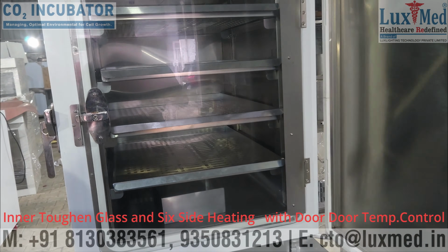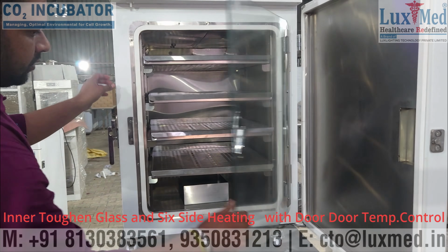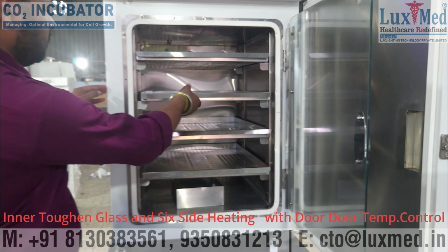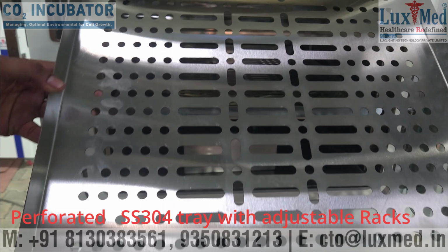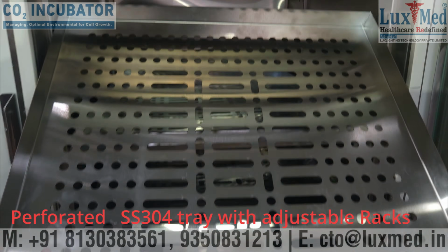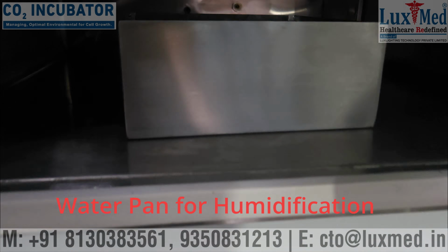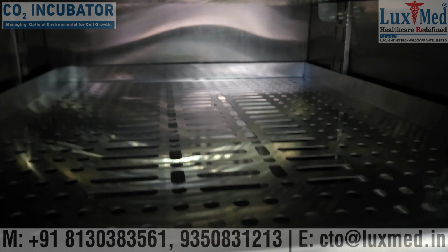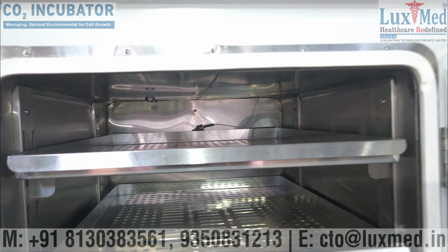CO₂ levels. The CO₂ concentration is carefully regulated, usually around 5%, to maintain the pH of the culture medium. CO₂ interacts with sodium bicarbonate in the culture medium to buffer the pH within the physiological range. Sterility. They are designed to prevent contamination by filtering the air and water used in the incubator, as well as providing a sterile environment for the cells to grow.